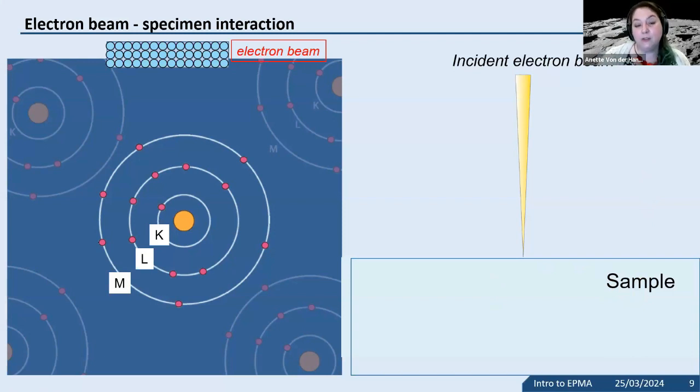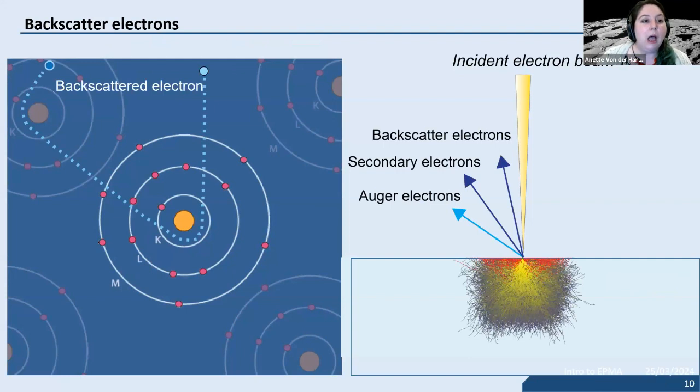The probability that it would never hit anything is relatively small. So when you use transmission electron microscopy, it's interested in those electrons, and usually you have to thin the sample a lot so that the electrons can be transmitted.